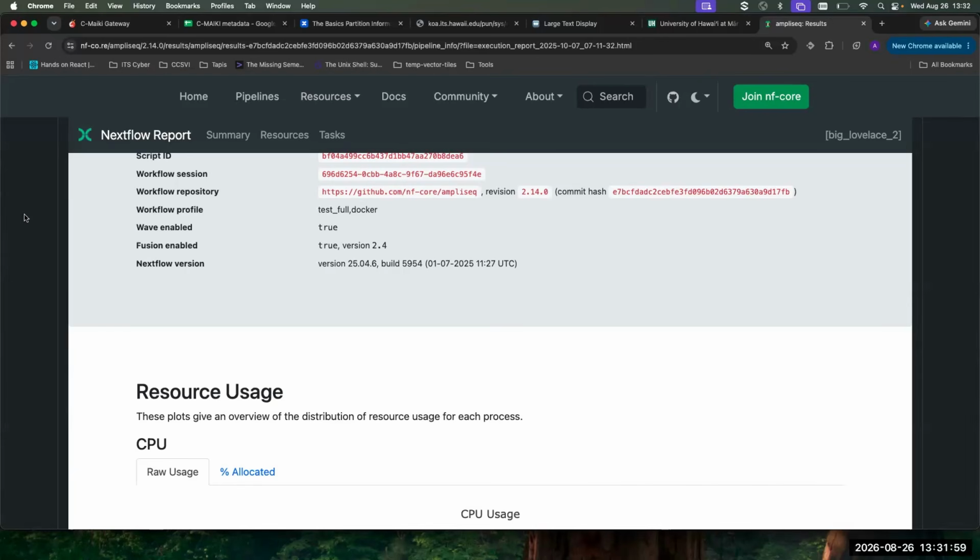Or you get so fluent in the gateway that you're comfortable making those tweaks. Because I use it all the time. I can do a lot of command line stuff, but I still use the gateway because it's really easy for me to run things and I kind of know what the back end is. And generally speaking, for the 16S, the back end is really, really well refined. But if you're doing something different than the standard EMP library, Nextera library, and 16S, then everything else is kind of the Wild West.